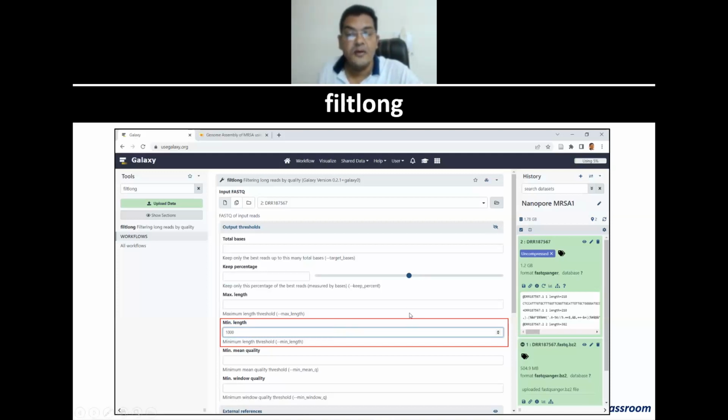Yes, sir. Sir, can we provide paired end reads also? Sorry? Can we provide paired end reads also, like you have uploaded? Yes.